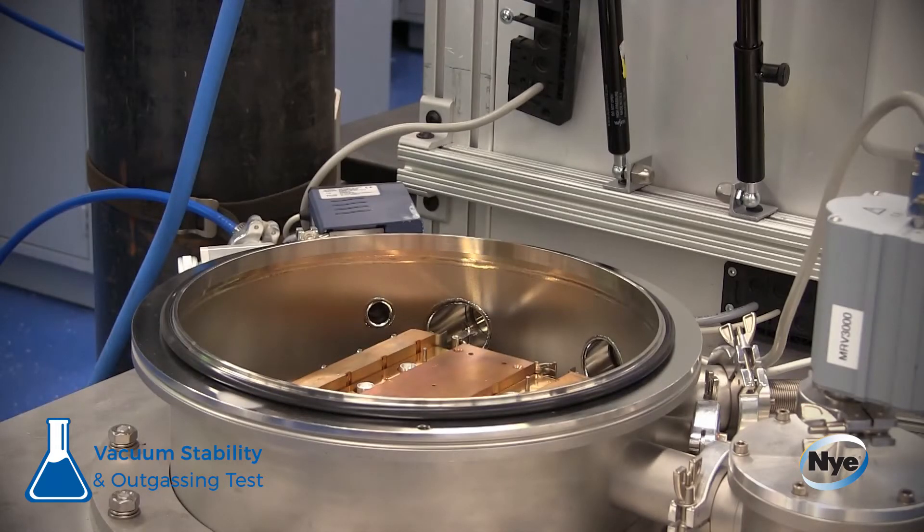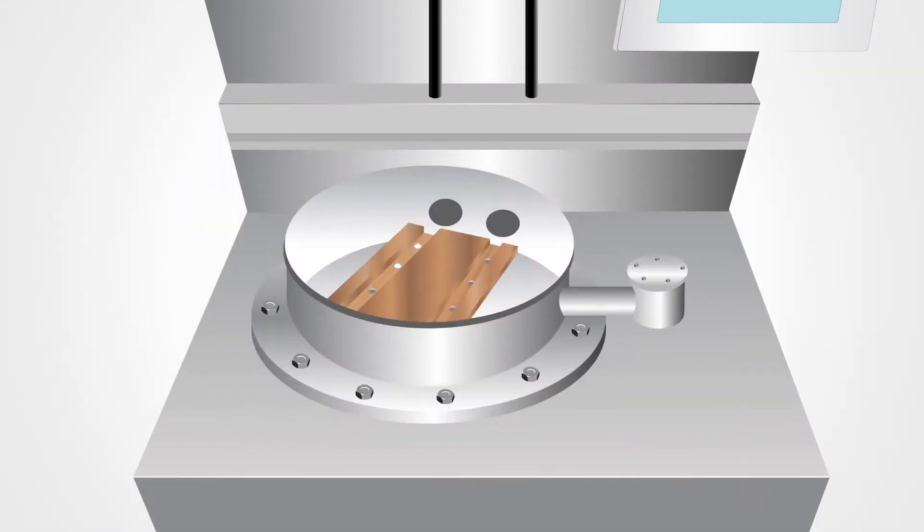Once the vacuum level has been reached, the samples are heated to a temperature of 125 degrees Celsius and the 24-hour test period begins.